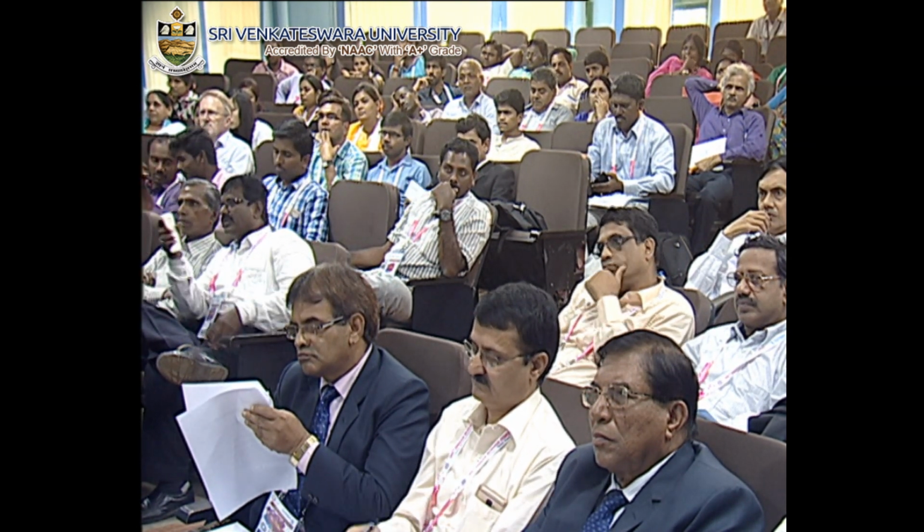My title is Application of Calotropis procera based chelating resins for the pre-concentration and estimation of iron, nickel, and copper in milk, cereals, and vegetable oils. Proposal and hypothesis: preparation of chelating resins from the wasteland desert plant Calotropis procera, commonly known as Akra. Characterization and investigation of various parameters on the absorption of metal ions by batch and column method. Development of methods of trace estimation of ferrous, nickel, and copper ions, and their application to milk, cereals, and vegetable oil.